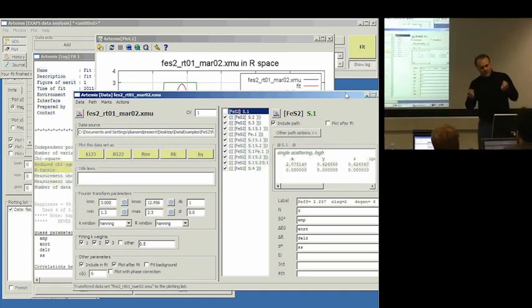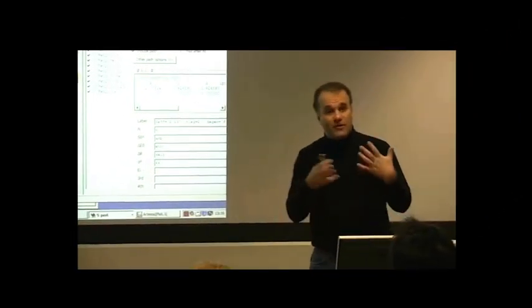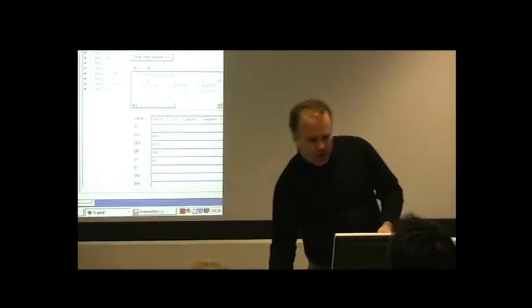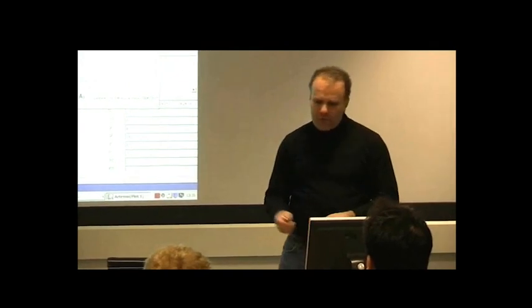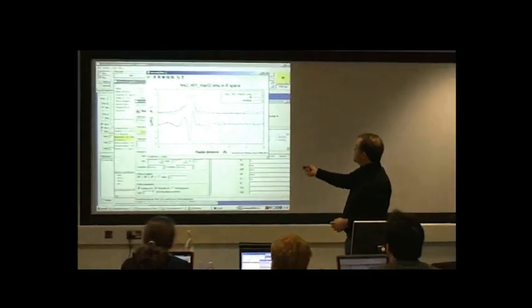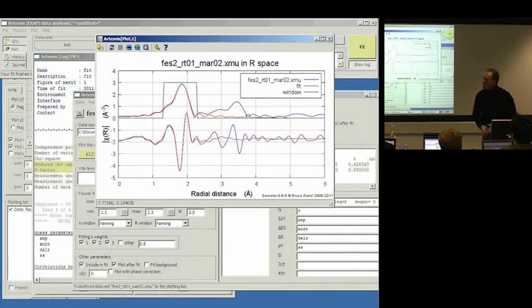Again, as I said before, I like to take small steps through a new research project. I find I get confused if I try and do too much at once. So the next thing I want to do is expand the scope of the fit to include this much of the data. So coming out to here. That's about 3.8, where the blinky cursor is right now.